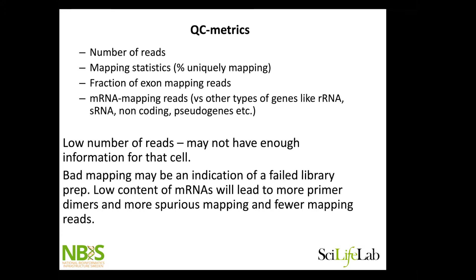If we have really bad mapping, it might just be due to low RNA amounts. You get a lot of primer dimers if you have too much tagmentation versus how much cDNA you have in the sample, and then you get a lot of weird mapping artifacts. And if we don't have enough reads in the cell, it might be a real cell, but we don't have enough information to say something meaningful about it.